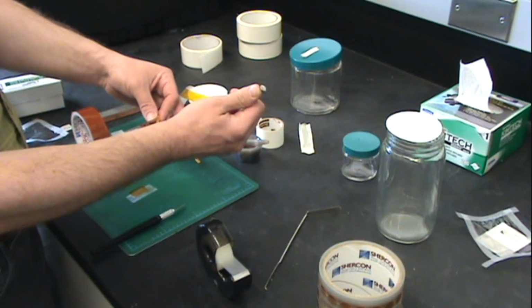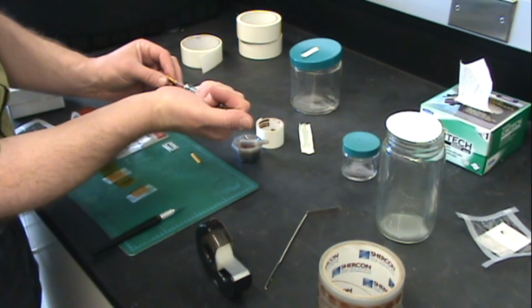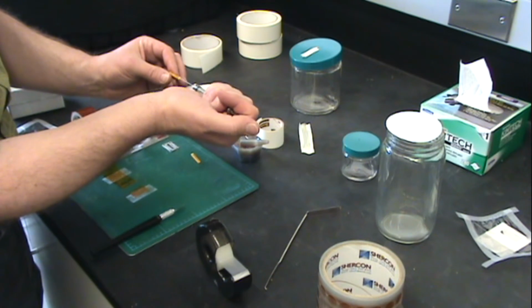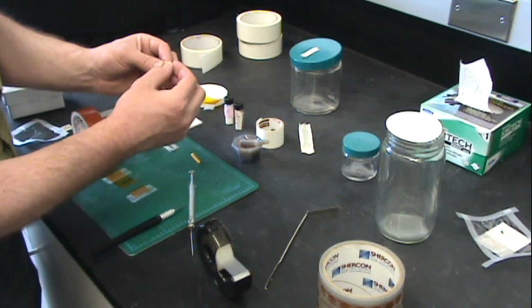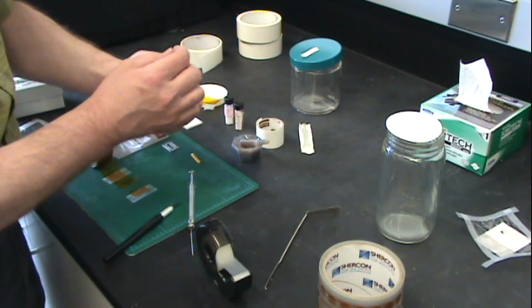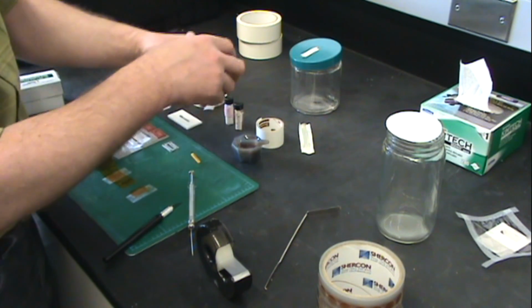Go in, take up, always take more than just what's required, and then go through the pinhole, then very slowly just push and gently pull out. Make sure there's no bubble. If there is any bubble, you can move around and pull out, push, and then let the sample come out a little bit. If there are bubbles in there, just tap it, make sure it's collected on the top, and then you can put it in a sample cell, a jar, take it outside, dip it into liquid nitrogen, and it's ready for mounting.